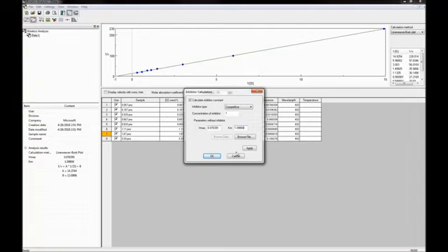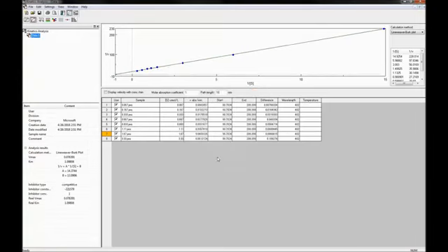You can also import the parameters from another view open in the Kinetics Analysis software by selecting Browse Data, or import a previously saved Kinetics data file by clicking Browse File. If the Vmax and Km were determined using another calculation method, the analysis will still be performed. If the parameters have been manually entered, click Apply and then click OK to perform the inhibitor analysis. The inhibitor constant Ki and the type are displayed on the bottom left side of the screen. The plot used to determine the inhibitor constant is overlaid in blue in the analysis graph window.